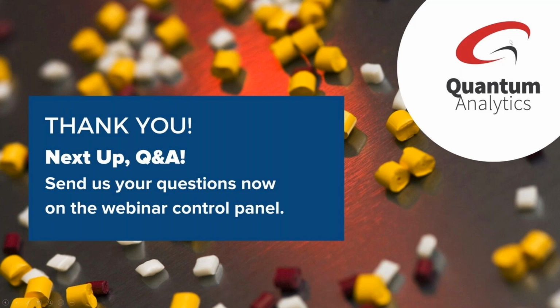Fantastic. Well, Tom, another great webinar. Let's dive into a couple questions here. And just a reminder to everyone, if you do have a question for Dr. Tom Tagg, you can type it into the question module that you see on the GoToWebinar control panel, and I will add it to the queue here. All right, so Tom, first question. The in-syringe imaging is very impressive. Can you speak towards how much penetration is possible?